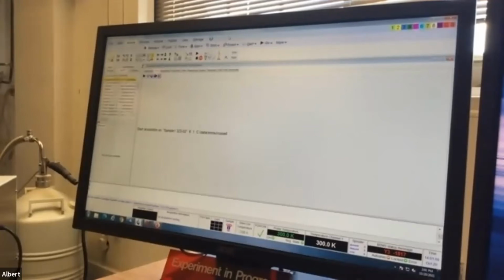So this is all collection of data so you can put it in your lab report appendix, because all these are the samples that we actually made. So the NMR data that's going into your lab report is going to come from these samples. And the infrared, on the lab report where it says spectral data, all of this is your spectral data. So this is the stuff that we collected to add to that appendix. So now press the photos off. Does that make sense?